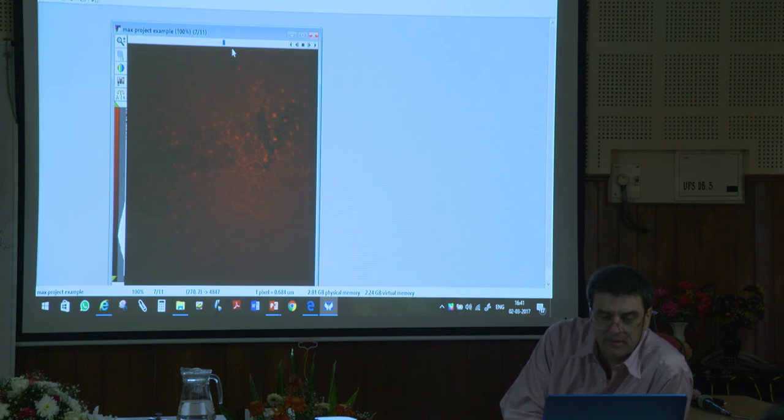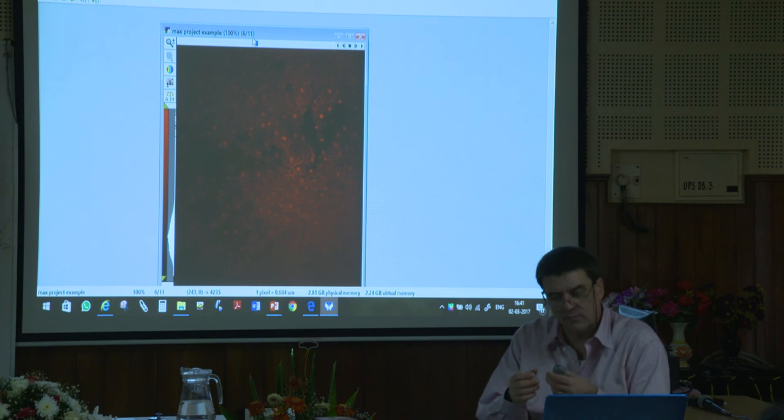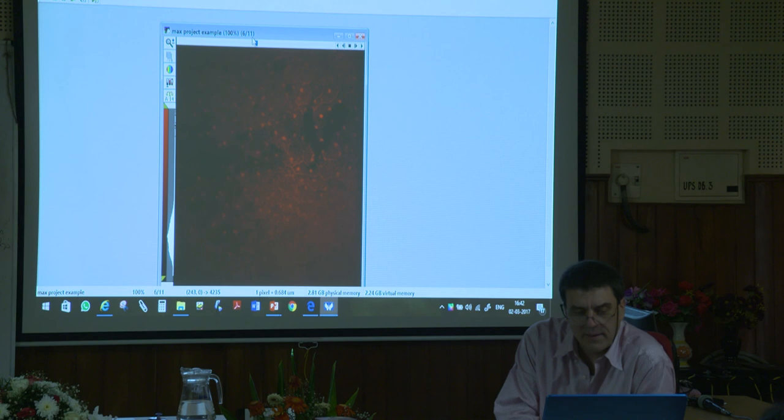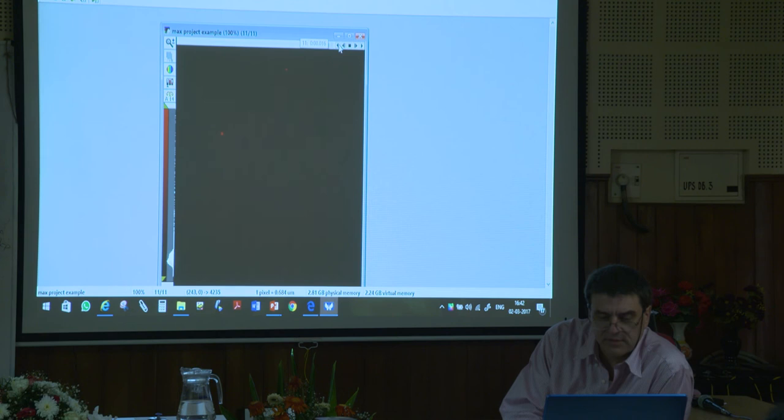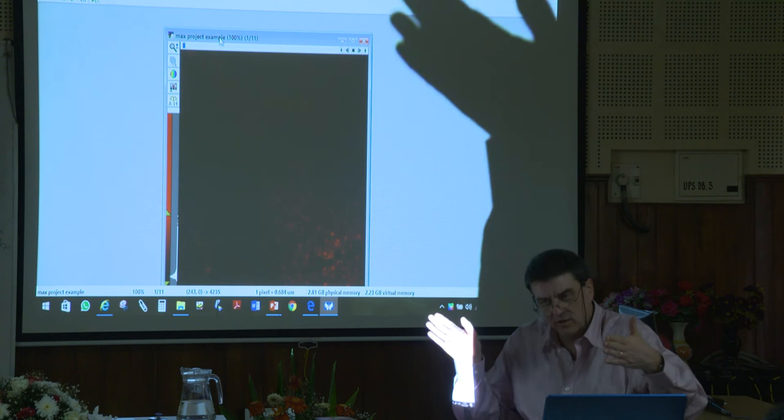of the retina. Now, the problem here is that they want to do image analysis on the size of these things. And the problem is the prep. The retina is a very gentle, very delicate piece of tissue, so when you take it apart, a lot of times it's not real flat like you'd hope. If you see here, I'm going through Z, and I got a lot of different sections, right? But what was the trick to smash all the cards together? Do you remember? If you got the whole deck of cards and you turn it into one card, what do we call that?